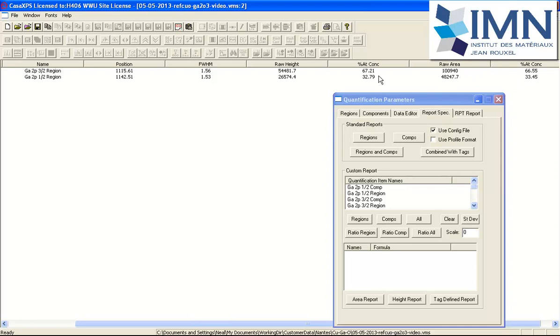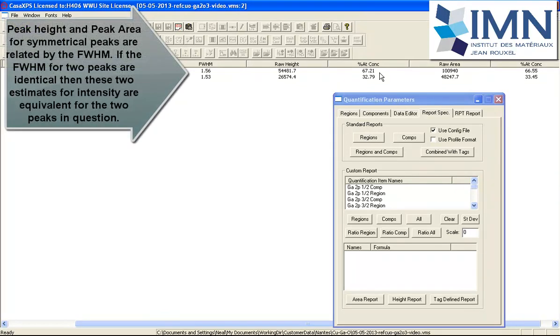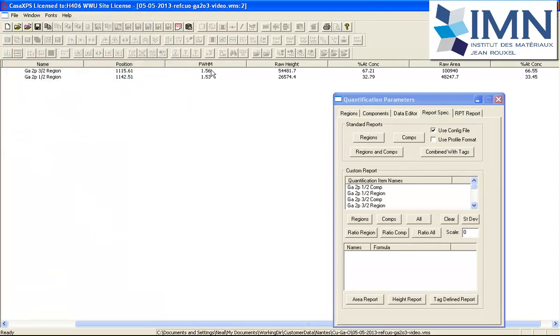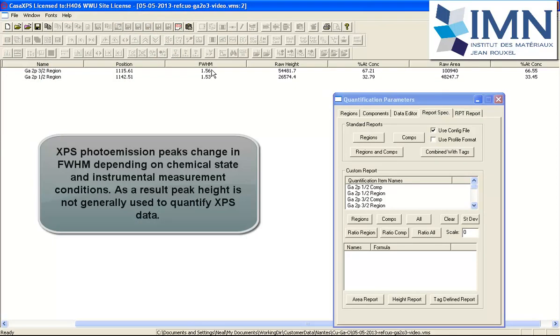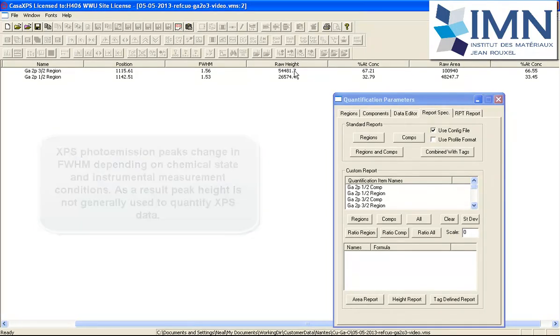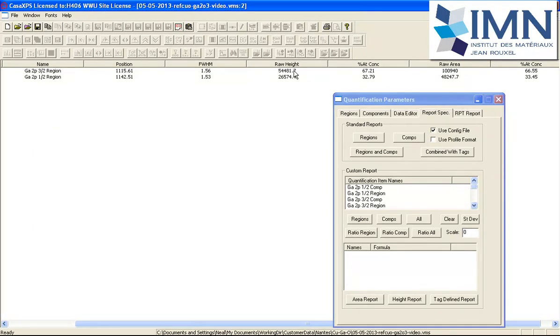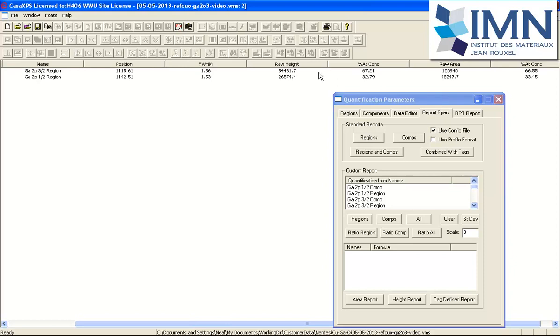We can see that the concentration looks very similar between the raw height and the raw area when the adjustments are made. But this is a bit of an illusion, because the reality is the full width half maxima are very similar, and therefore the area and the height will be almost equivalent when you have the same full width half maxima. However, if they're different, then the concentration calculated using the same RSF for the height and the area would be very different.